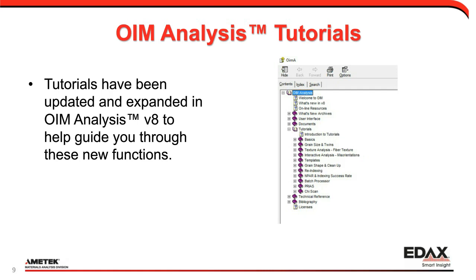That's the point of these tutorials, saying, okay, here's this data set. Again, there's a whole bunch of sample data sets included with OIM Analysis 8, and we want you to work through those to better understand what you can do to the data and the workflow for that. That's often the most common question I get: how do I do something? Usually the question isn't if you can do something in OIM Analysis, it's how to do it. Because if you've thought about it, it's probably already in OIM Analysis, because it's our workhorse and has been now for 20 years. So it's just an incredibly strong tool for any sort of analysis you want to do.